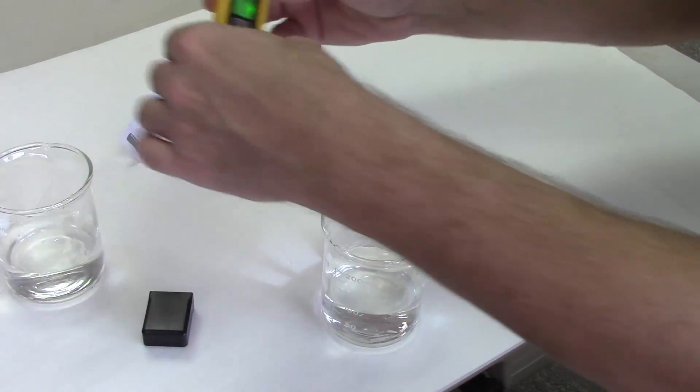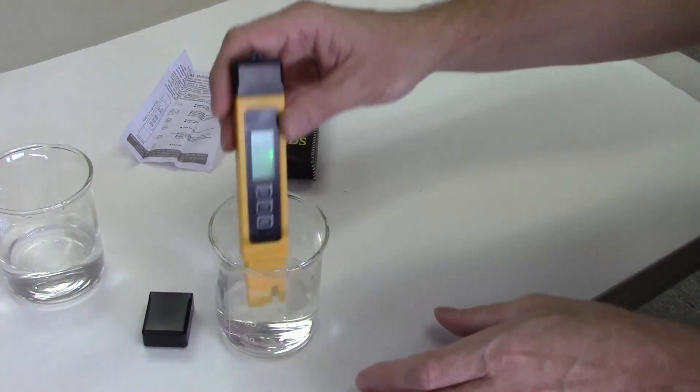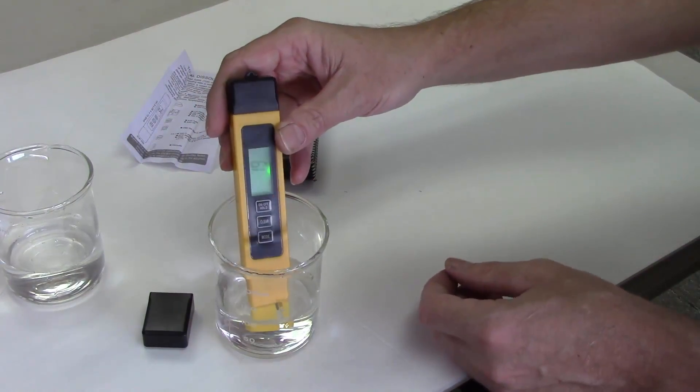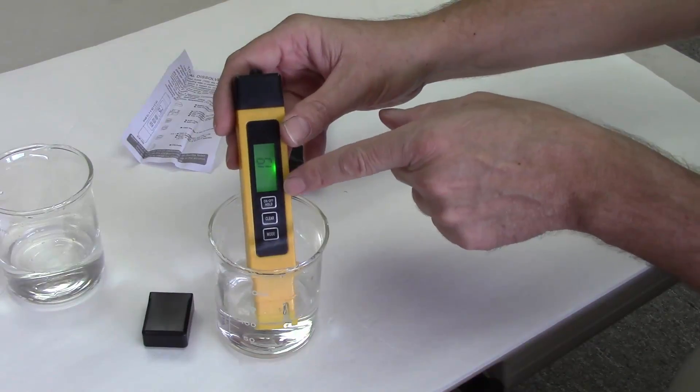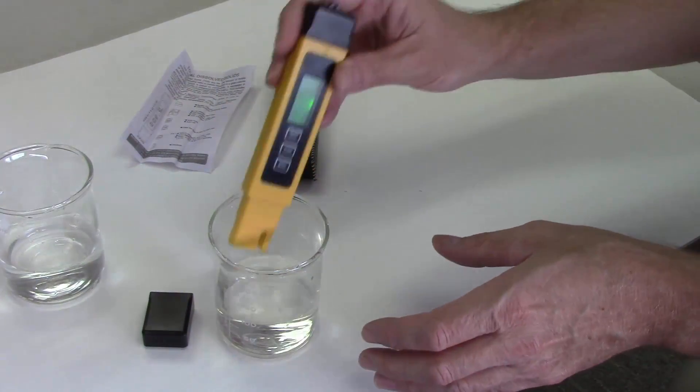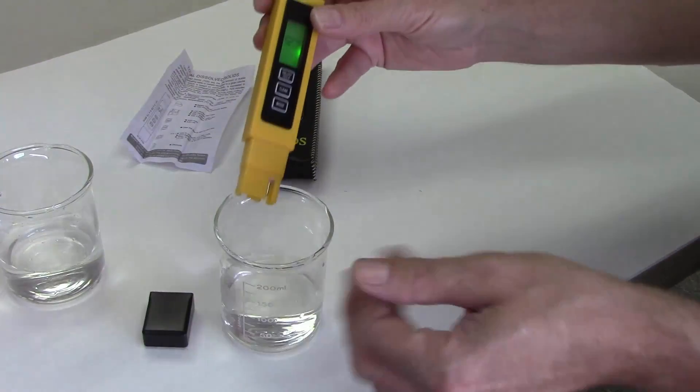And then you press the clear button and go over to my next sample. We have the RO water, and the display screen, which I don't know if the camera picks up or not, does not turn red because you're not getting a high enough value on there. So my RO water tested at 19 parts per million.